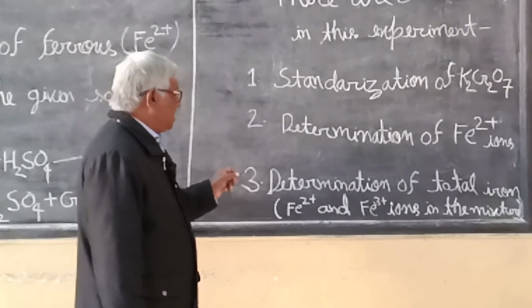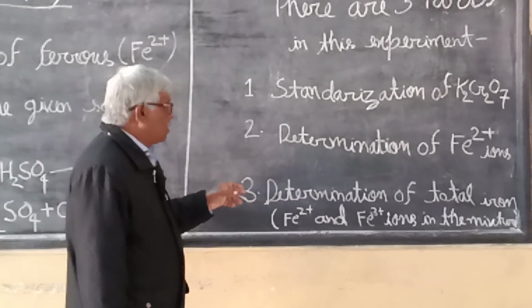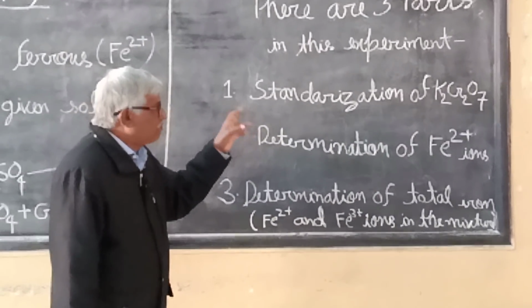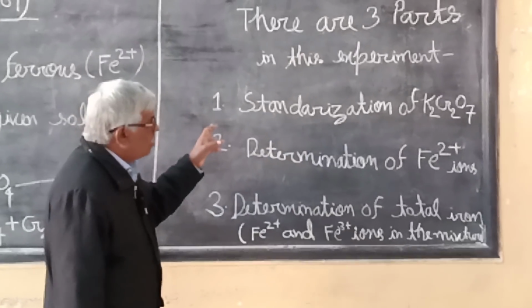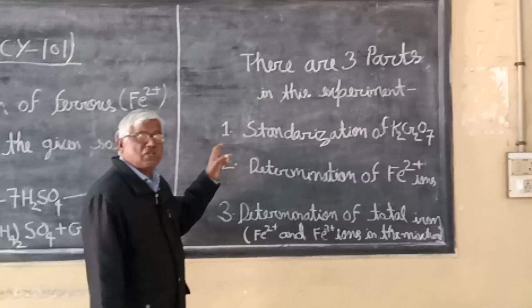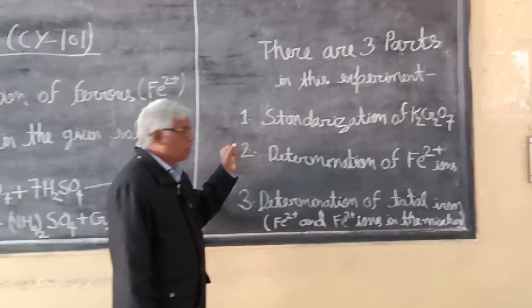First we standardize the potassium dichromate with the help of the standard solution of ferrous ammonium sulfate.